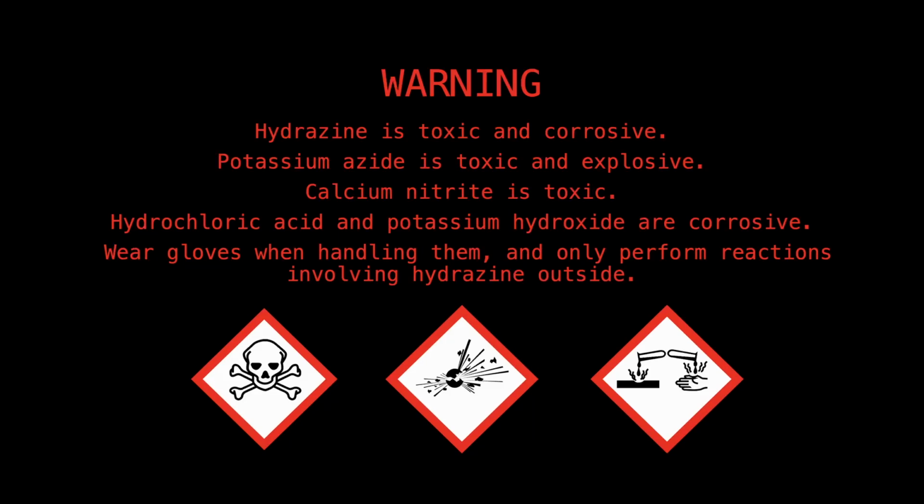Warning: hydrazine is toxic and corrosive. Potassium azide and calcium nitrite are toxic. Hydrochloric acid and potassium hydroxide are corrosive. Wear gloves when handling them and only perform reactions involving hydrazine outside.